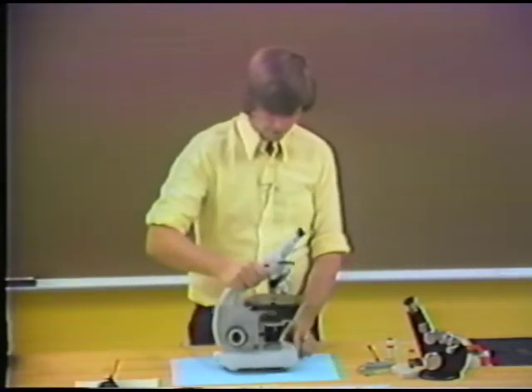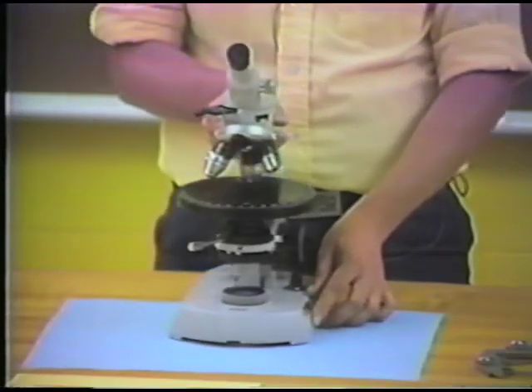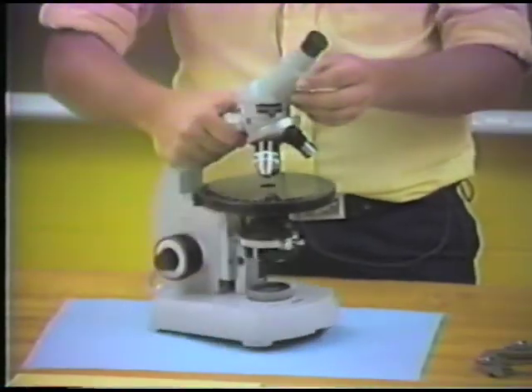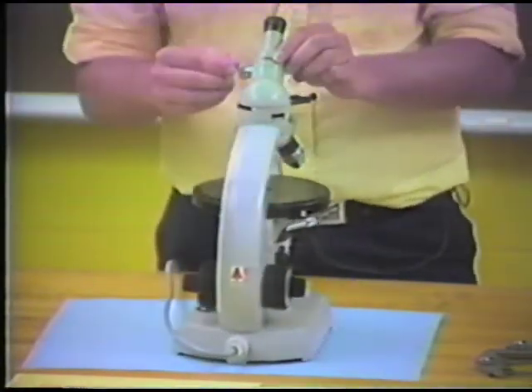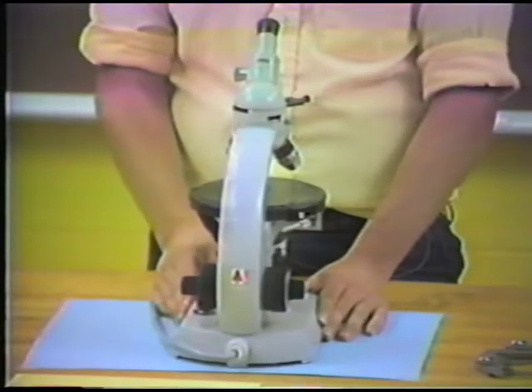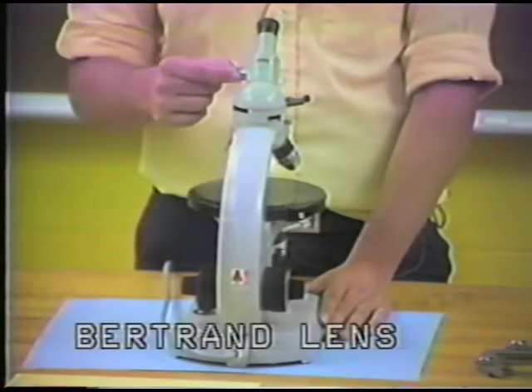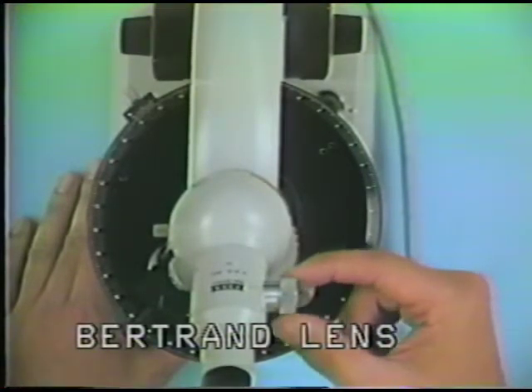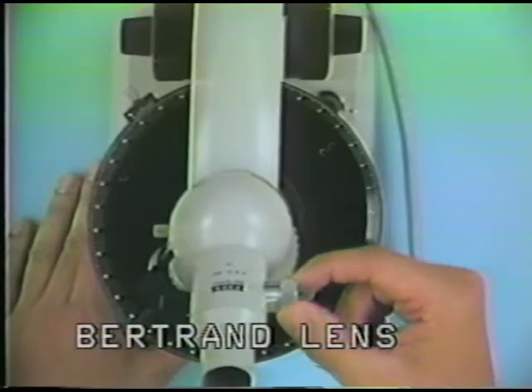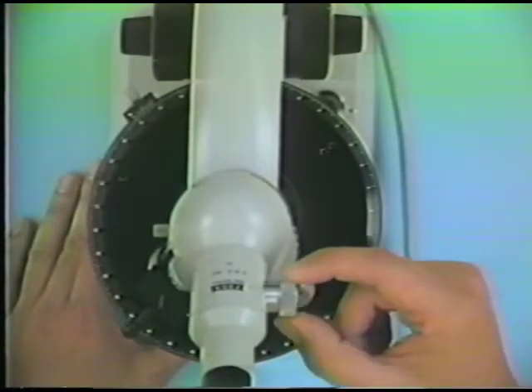Here's a microscope here. I should show you one last part of the microscope, which is located up here on an upper control. This is a control of something called the Bertrand lens. The Bertrand lens is a lens very similar to the converging lens that's found below the stage, which flips in and out using a knob here in this location.